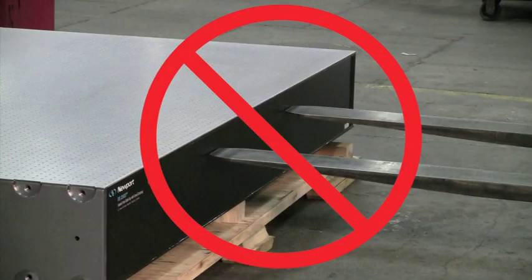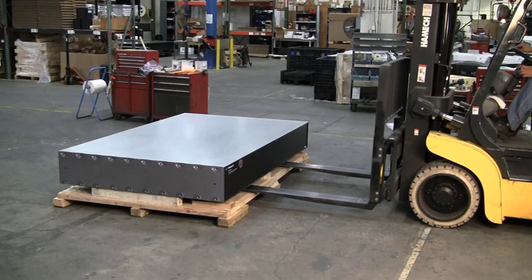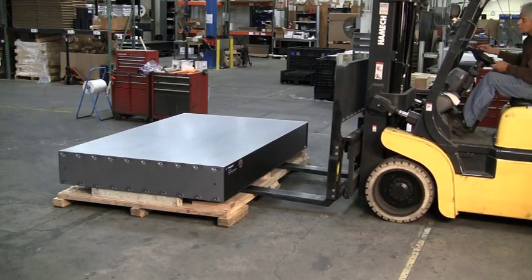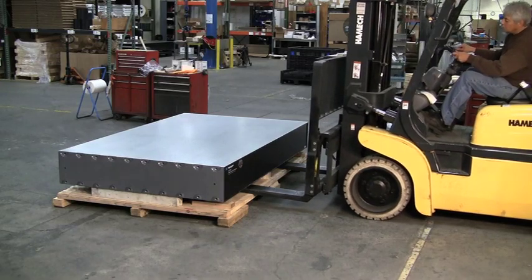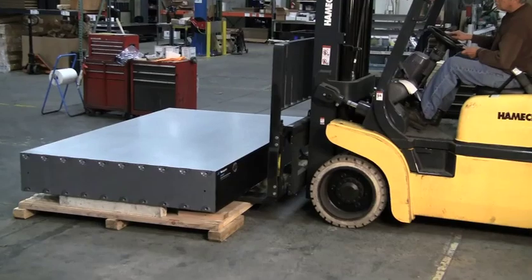Under no circumstances should you attempt to use a forklift or other blunt tool to push or lift the table along its side wall or top skin, as this may result in damage to the table. Slowly lower the skid back to the floor and remove protective wrapping around the table. Carefully position lift forks underneath the table to safely lift the table off the skid and move to the installation area.